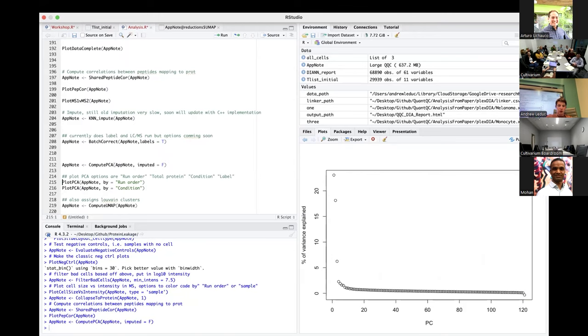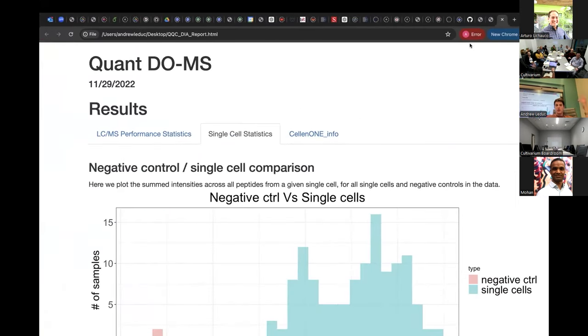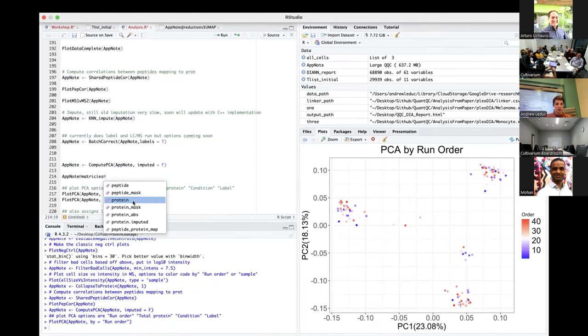So I can plot it by a variety of things. You saw these plots already. The aspiration is not to be comprehensive, but it was a byproduct of generating these reports, and it might be useful for some people. So say I want to do my own analyses, I can go to the matrices node, and within there is my protein matrix, and I can view it if I want, or set it to a new variable, save it as a CSV, and do any other analyses I might be interested in.